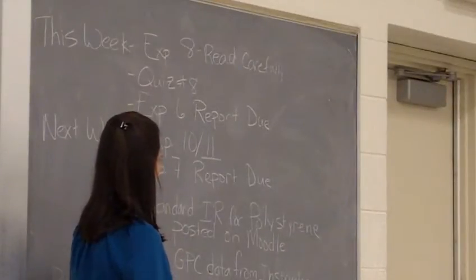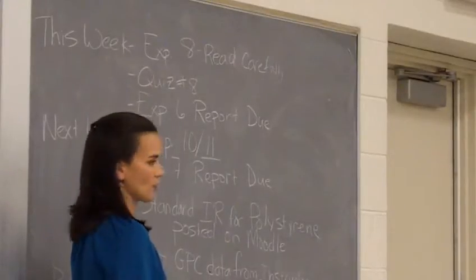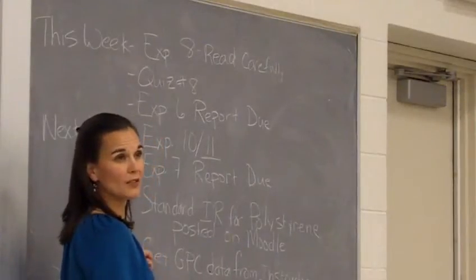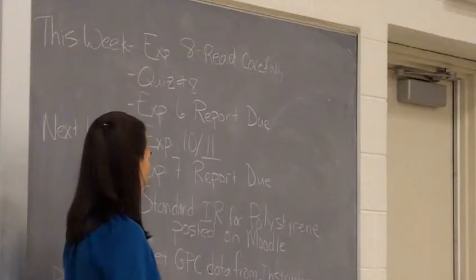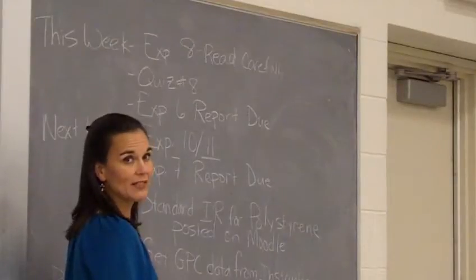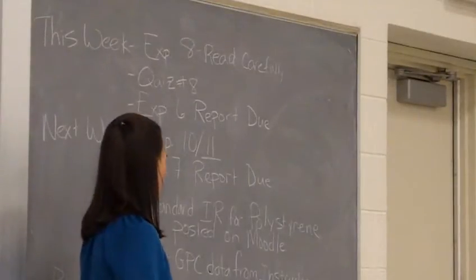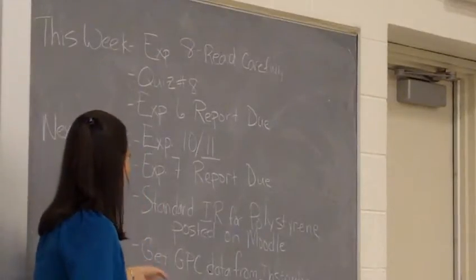And for your experiment 7 report, you also need to get GPC data from your instructor. So we couldn't run anyone's samples last week with the GPC because the GPC is sick. But we still want you to analyze GPC data, so we have data that we want you to analyze for your report. We'll give that to you this week, in lab.